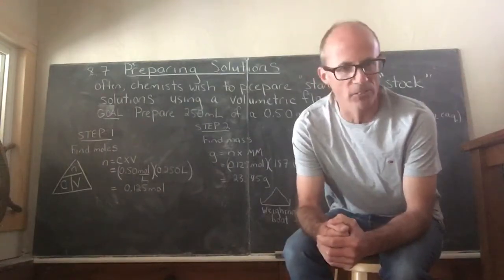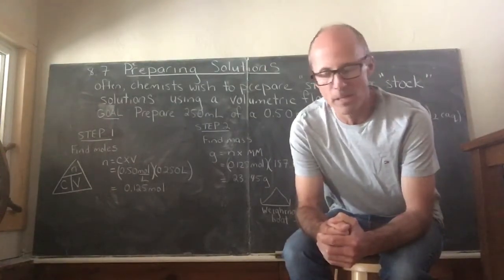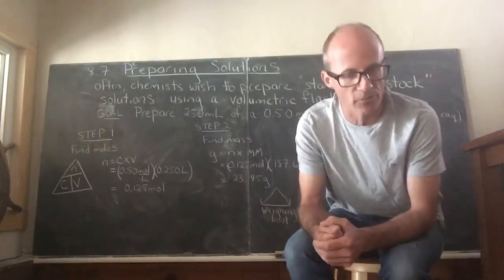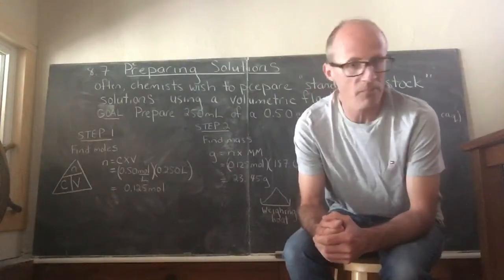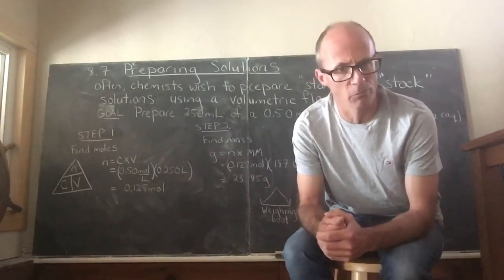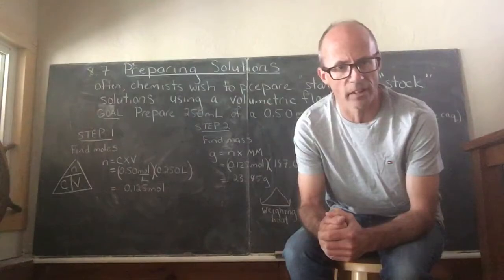In biology, we oftentimes, for example, use volume percent, and a great example of that would be a saline solution, or even maybe a 3% volume for volume solution of hydrogen peroxide, which we use in first aid kits. It's also an antiseptic, and I have it in the chemistry lab as well. The last unit, if you recall, that organic chemists and inorganic chemists tend to use the most is molarity, or moles per liter. And that's the unit that I want to focus on here.